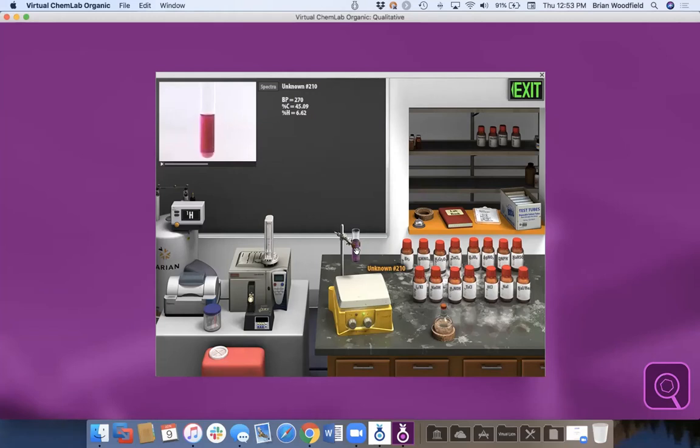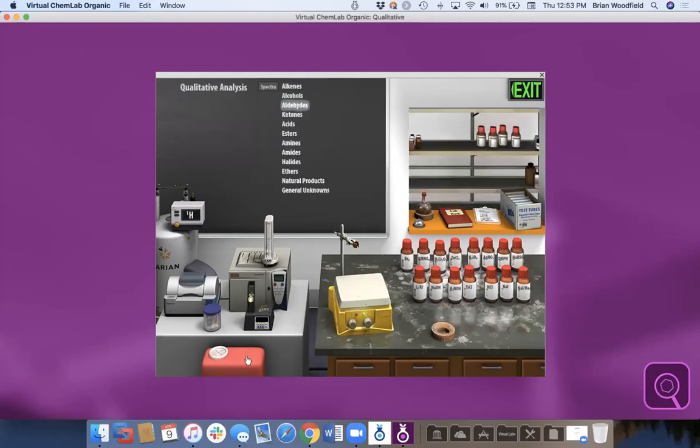So the question becomes unknowns again. In this case, we have, like we said, these numbered unknowns, and in these unknowns they would go through and do the same thing, and just report their unknown number and say what compound they have. And then we give you in the instruction manual the table of what the unknowns are. All right, so that's one way.